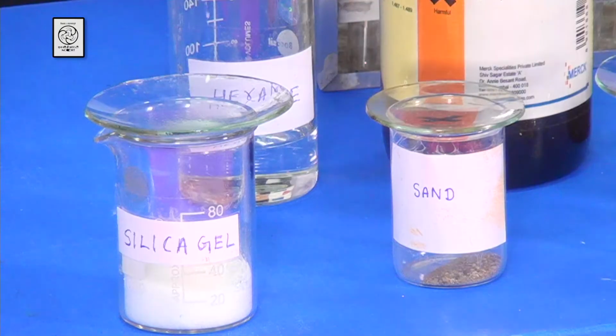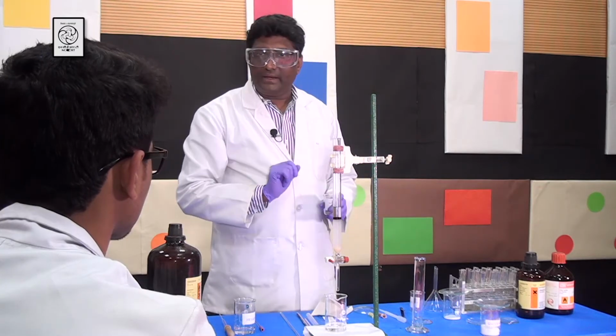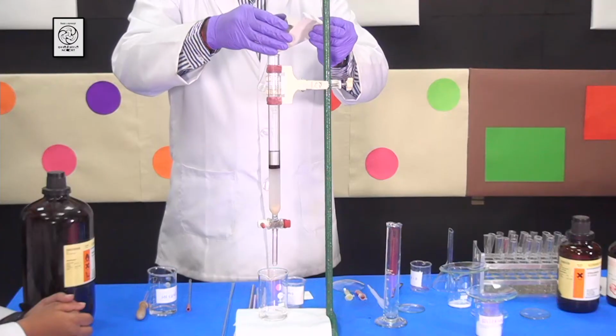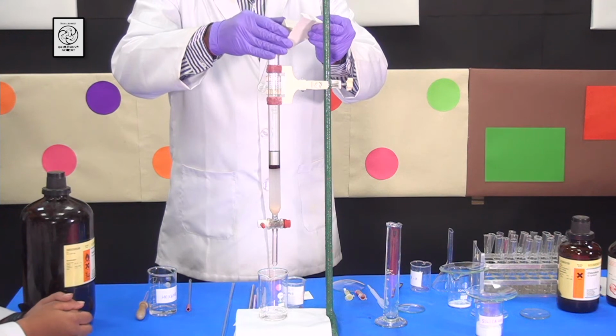Now I am going to add some sand on the top of this mixture layer. So for this I am taking some sand and I am going to add it. Sir, why are you adding sand here?